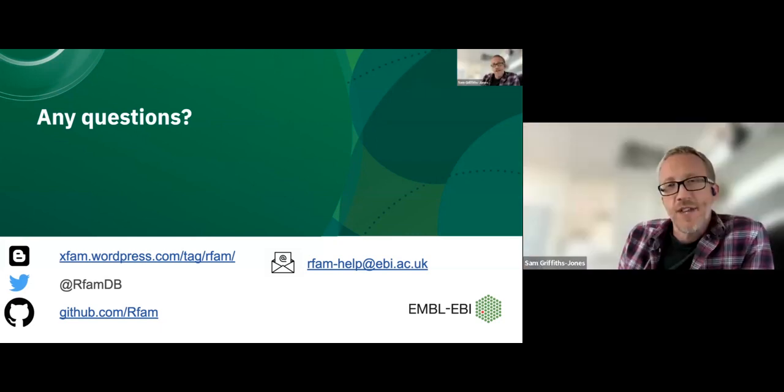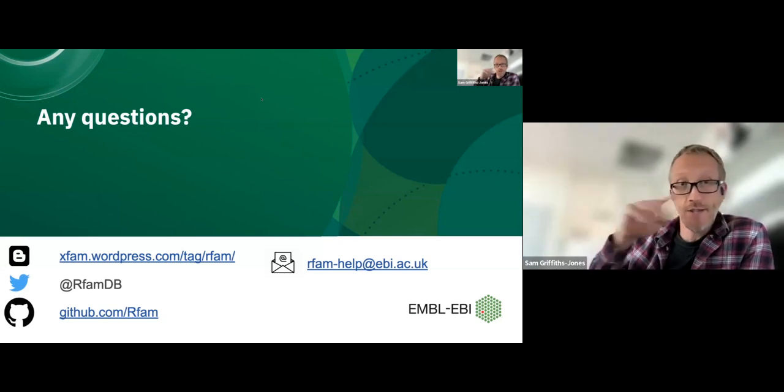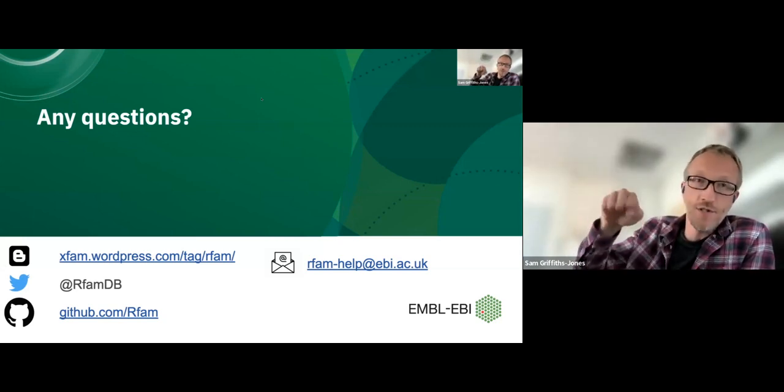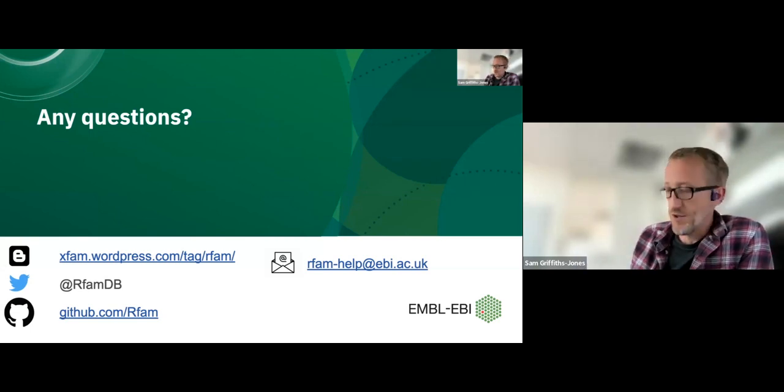Well, can I add something to that, Nancy? What Nancy's just described is how an Rfam curator decides where the score threshold is going to be, above which Rfam is saying everything is a real match, and things below this score are perhaps not. We're starting to find false positives. But I guess that's part of a larger scheme.